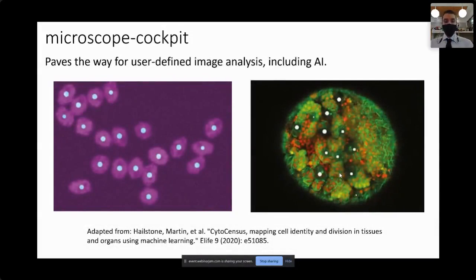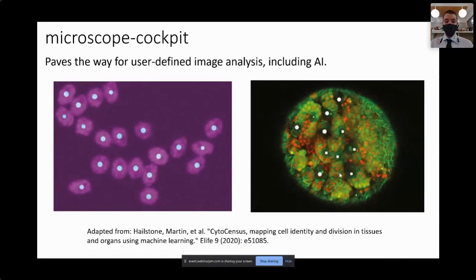Cockpit also acts as a gateway to user-defined image analysis, such as AI. Here the usage of another piece of software for CytoCensus is shown, which uses AI to identify cells.